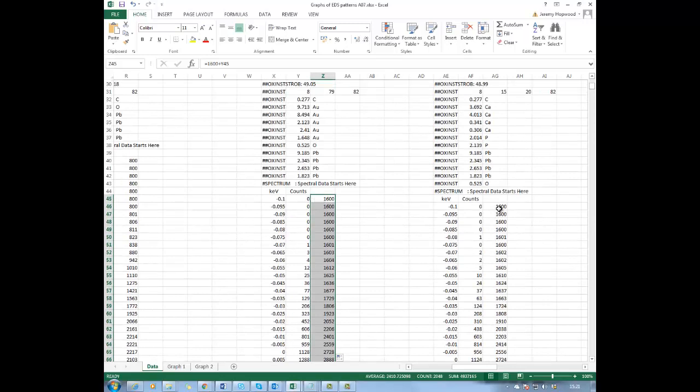So this one is going to be 2000. We're going to the 2000. I'll drag that one down.